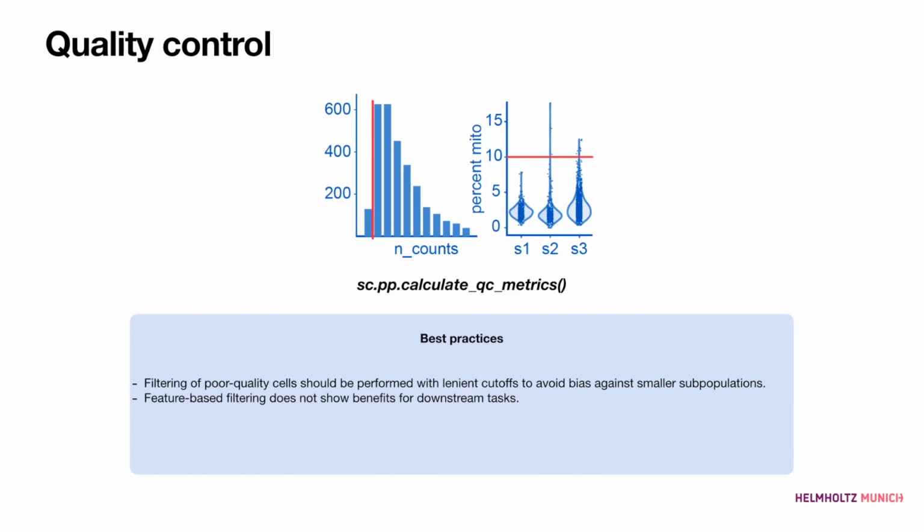You don't generally use the ribosomal content, it's not something you look at? No, this is actually also something you would look at. Yes, okay. Sorry, and would that include regression as well, or no? That would just be the quality filtering first, or would you also regress for those factors?